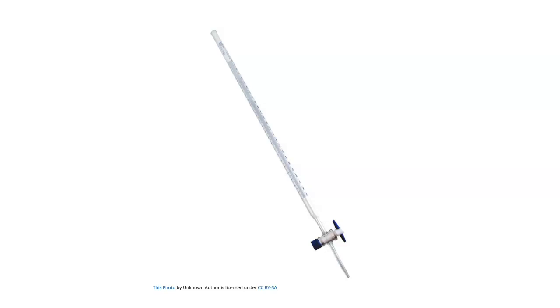Make sure when you're rinsing with any kind of water, tap water or DI, you're letting it go through the tip also, so you're washing the tip out also. Then you'll do one final rinse with DI water, and you can actually let that go into the sink. Don't get confused. Just use your waste container if you don't want to remember. But just do a final rinse with DI water, leave the tip open, and return it back up to the teacher's desk or the cart at the front of the desk.